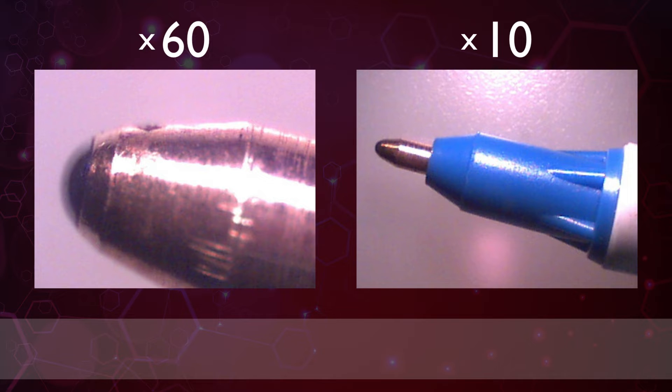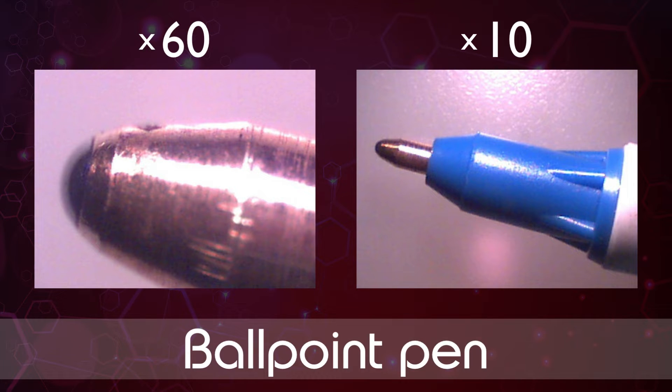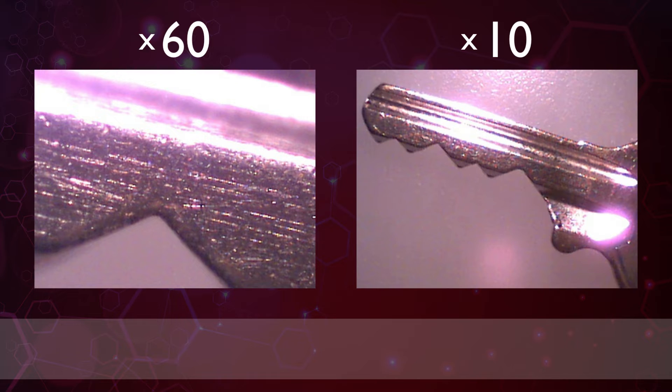The first image is of course a ballpoint pen. Number two looks like this. You're doing well if you can guess it from that. This should make it far simpler. That's right, it is of course a key.